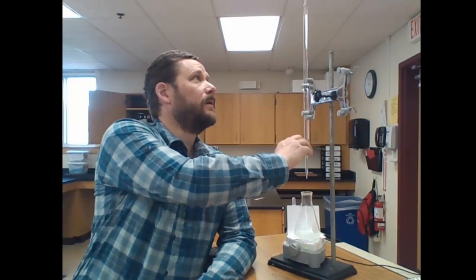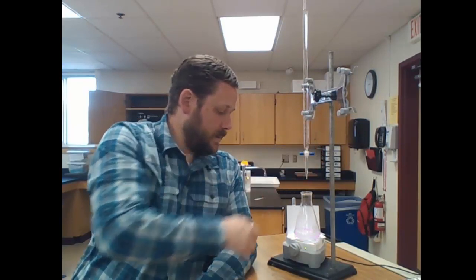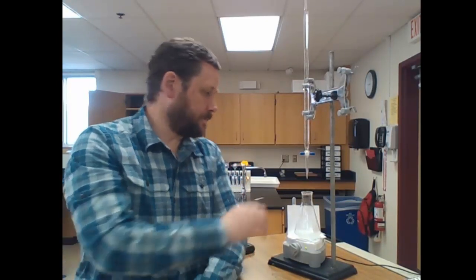I'm getting closer to the endpoint because when I add a milliliter of base now, the pink color stays for a little bit longer. See if you can see the pink color that I'm talking about. That definitely stayed for a little bit longer. I'm going to slow down, and instead of adding 1 mil at a time, I'm going to add 1/10 of a mil at a time.